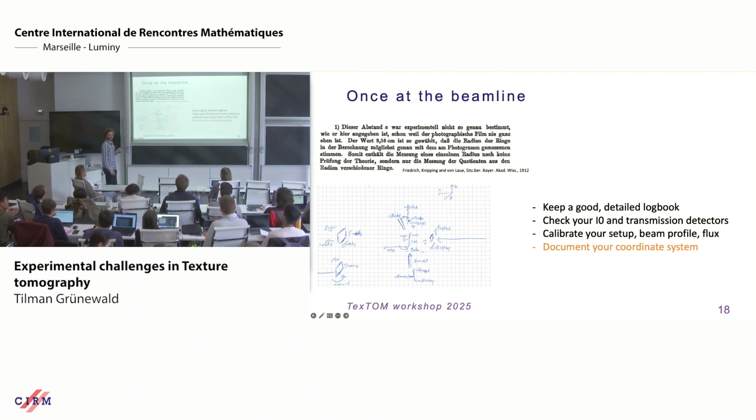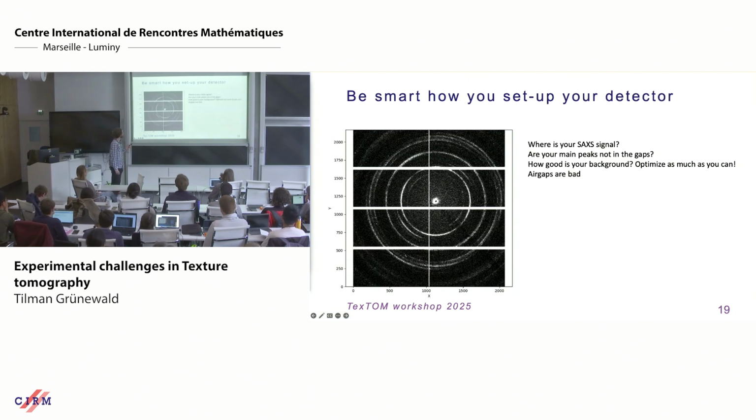I cannot overstress how important keeping a good logbook is, and I'm not good at keeping logbooks myself. Also, make sure that the signal you're interested in is not ending up in a detector gap. Just a little personal experience here too. Air gaps are really bad.